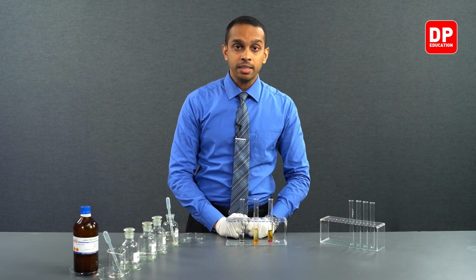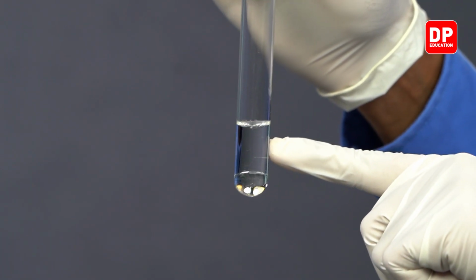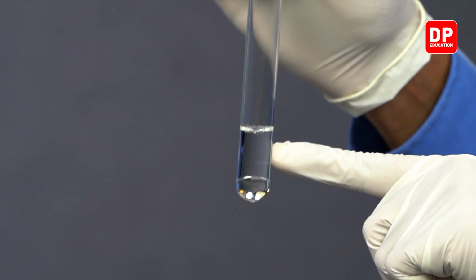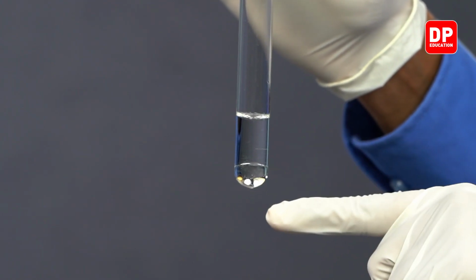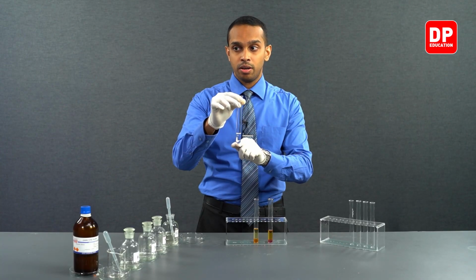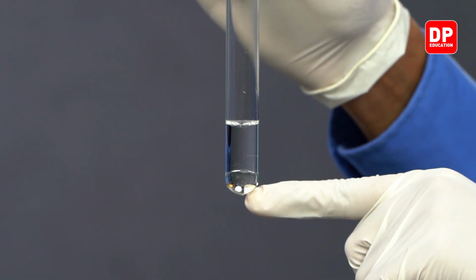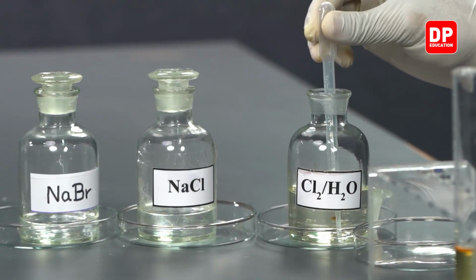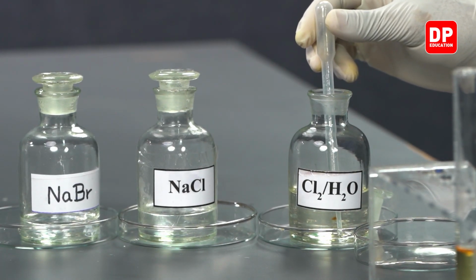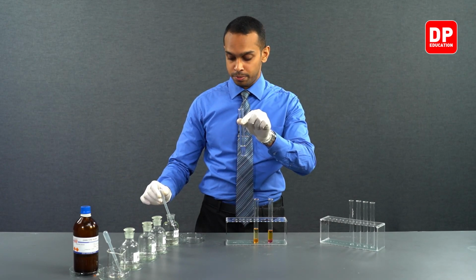Now, finally, we will be taking the sodium chloride aqueous solution that is coupled with carbon tetrachloride. So in this test tube, we have a layer of aqueous sodium chloride, which is a clear solution, and at the bottom over here our carbon tetrachloride organic layer. Now we'll be adding a little bit of chlorine water onto the sodium chloride solution.